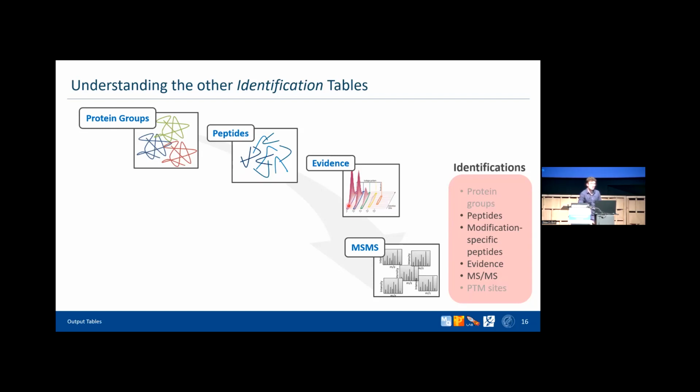So what we want to do is first identify each peak here, and then do a second MS on this, and then hopefully we will match the spectrum to one of the peptides in our database. And we don't want to do this just once per peak, but it would be nice to do this multiple times per peak, because then we would have a lot of evidence that, yes, true, this peptide is in our data.